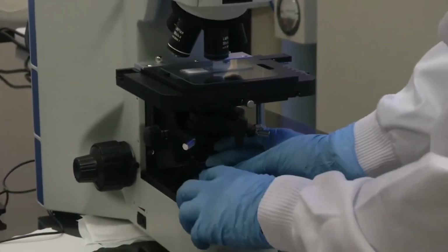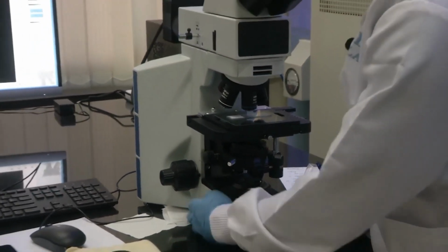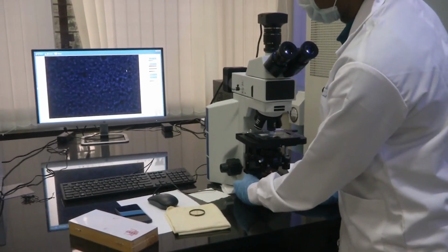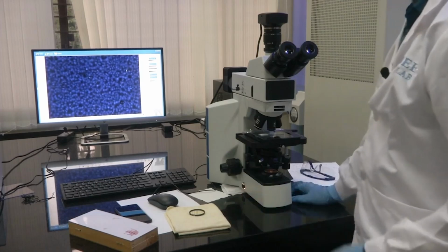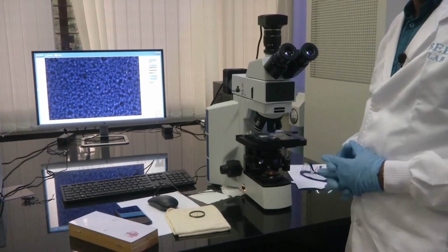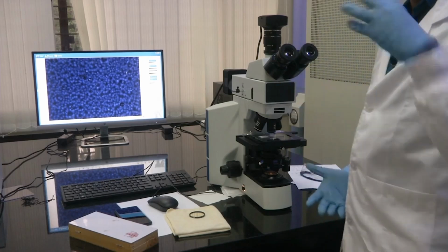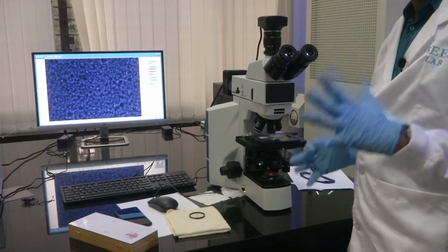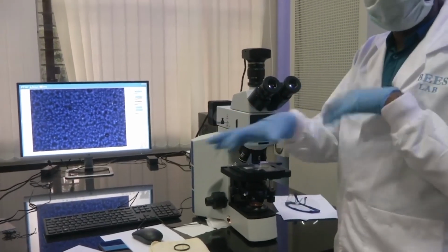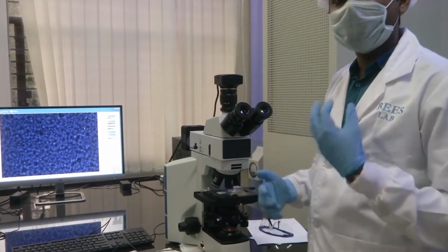Once we are putting it in the bottom illumination, we have to switch on bottom illumination, right. So, we have switched on bottom illumination. This is another light source, another method by which we can do fluorescence microscopy, which I discussed before. What happens in this is, you excite your sample with a particular light. Your sample will respond to only a particular wavelength. Let us say you excite your sample with blue light only, then parts of the sample which will respond to that blue light will start emitting another light back. That way you can measure fluorescence microscopy.